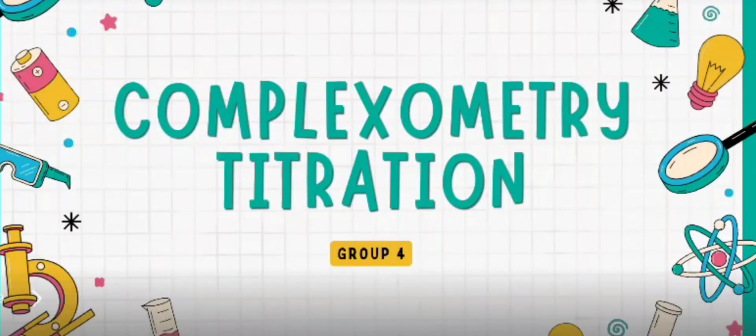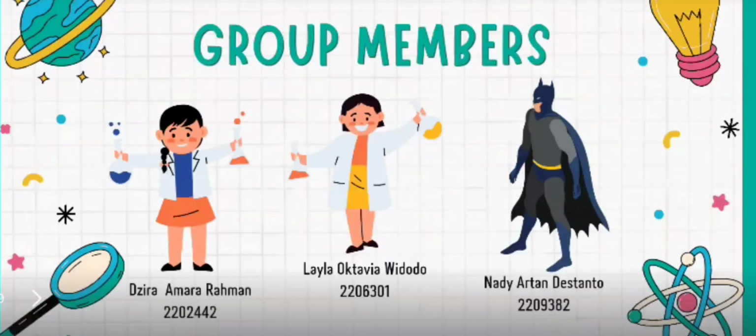And in this video, I will present how to do the complexometry titration. But before that, I will introduce my group.